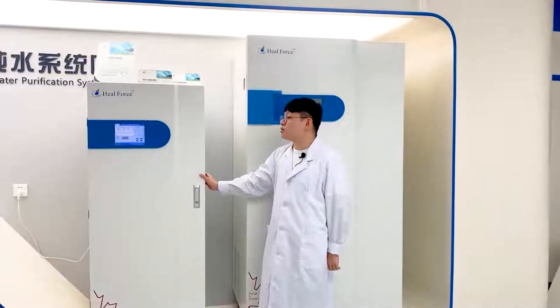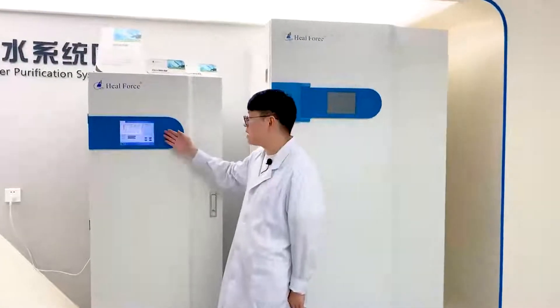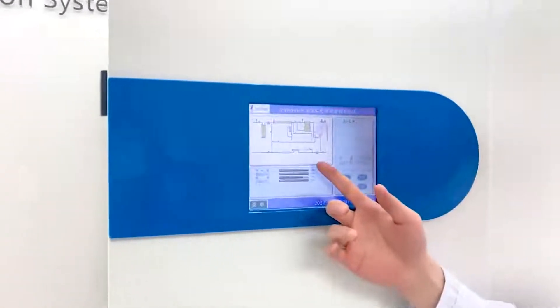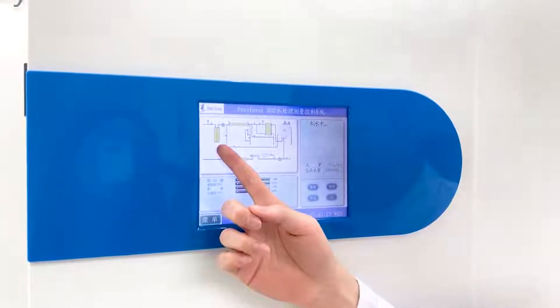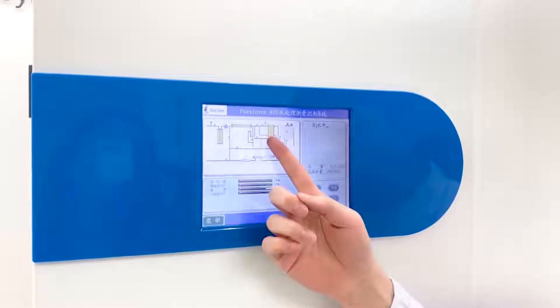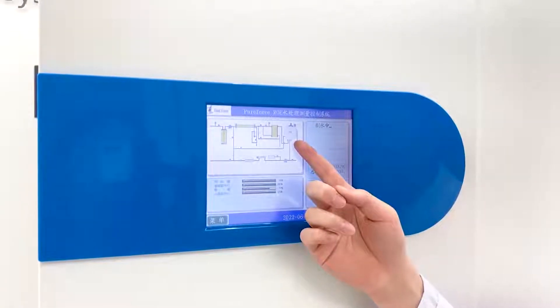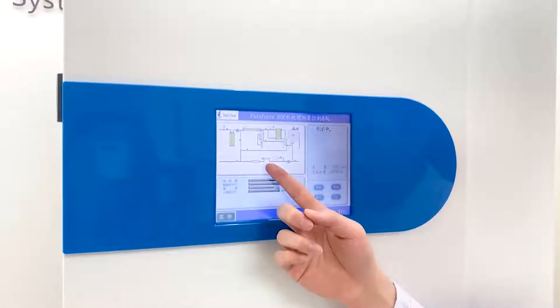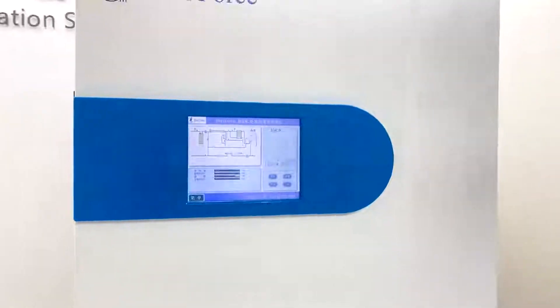This is our Pure Force ROE series. It has a touch screen and displays the full purification process: pre-treatment cartridge, RO, EDI, a 6-liter internal water tank, UV lamp, and micro filter.